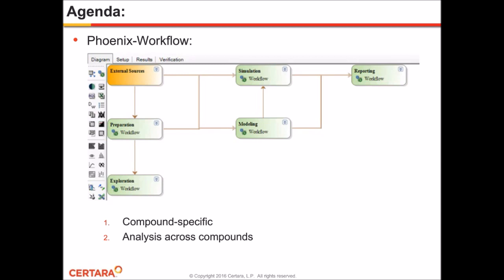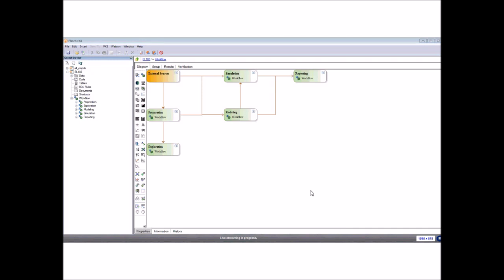So in the first workflow, we will look at a single compound. And briefly in the second workflow, I will show you how you can compare several compounds in one workflow. So let me switch over to the software demo, to go to Phoenix. This is the Phoenix interface. You see it's exactly the same workflow shown here in the main window of the Phoenix interface.